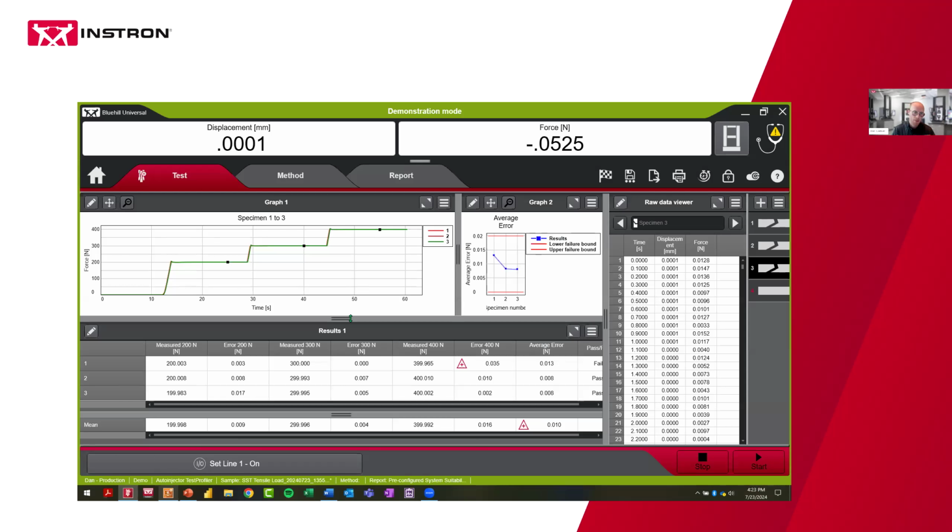And then number two, if your device is actually getting triggered during a test, you have to remember to go back into that menu and set the default state that the method is anticipating in terms of toggling it high to low. Whereas this is a much more simple way for users when they're setting up a test to be able to do that trigger. Okay, all right, so then that is the digital output soft key.